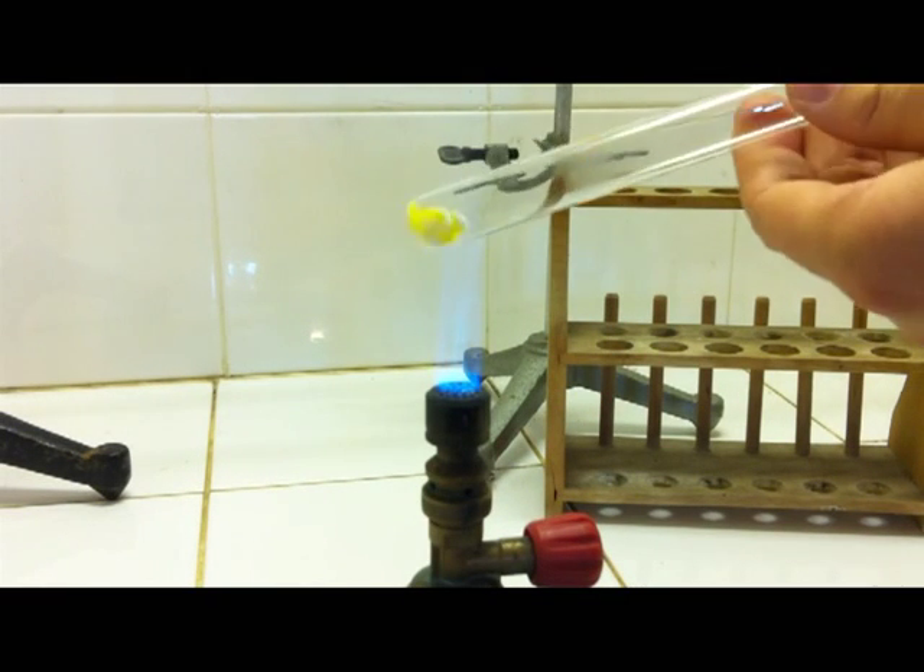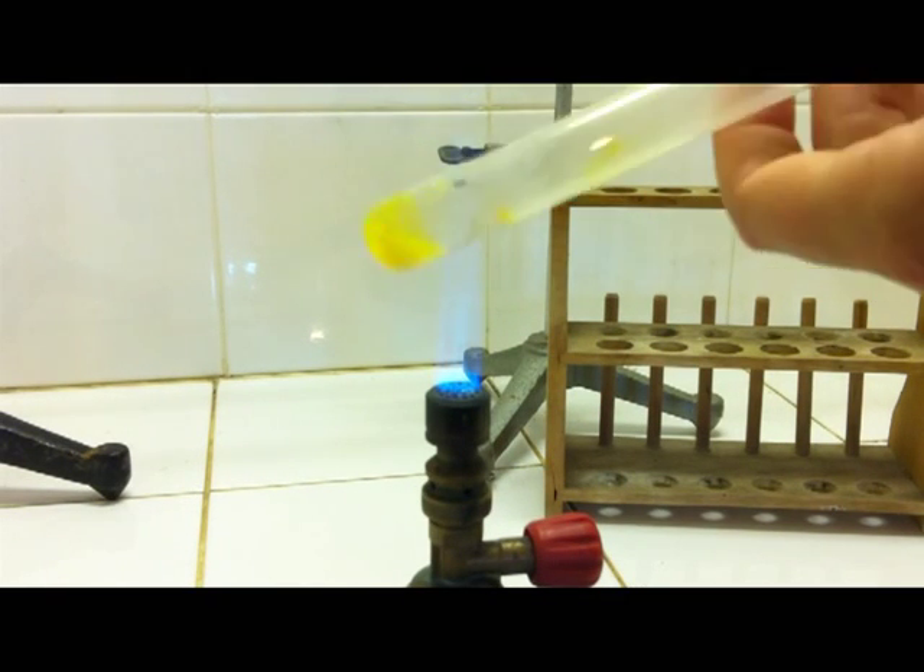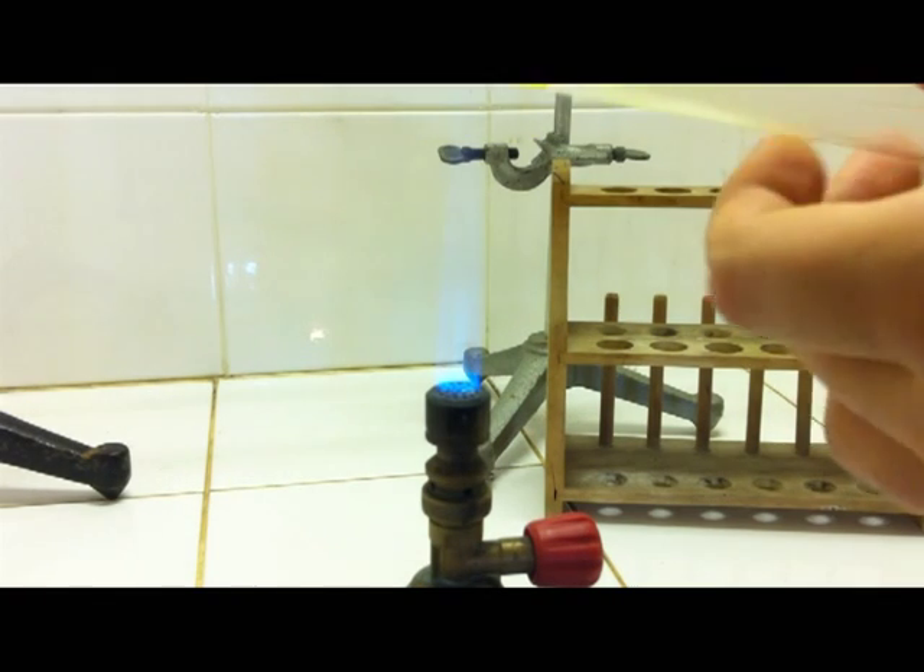This mixture is prepared in a test tube, stirred up a bit, and then carefully melted over the flame of a Bunsen burner to form a nice layer on the inside of the test tube.